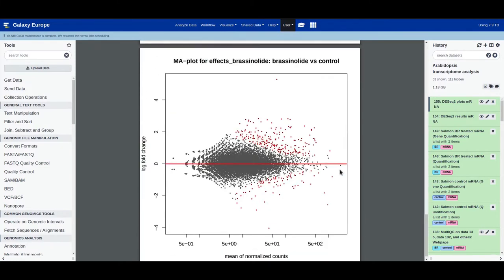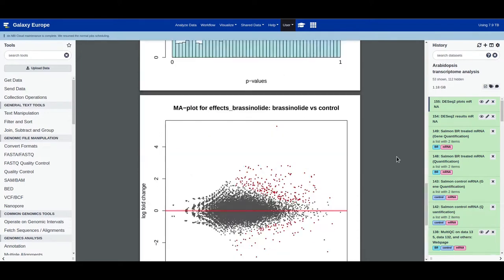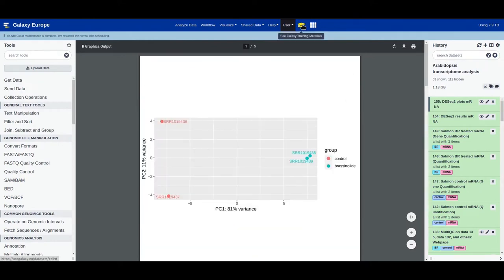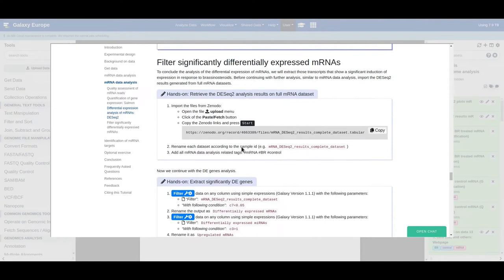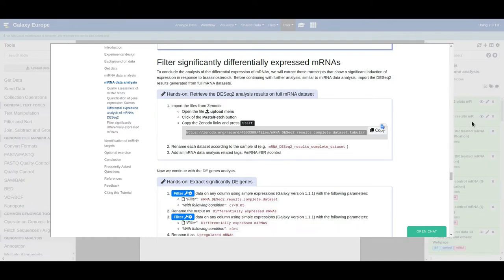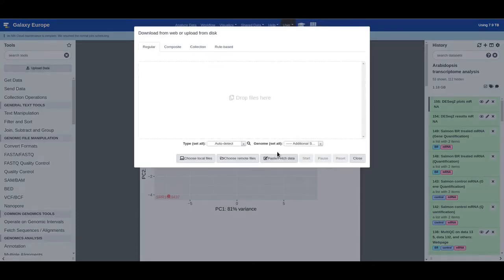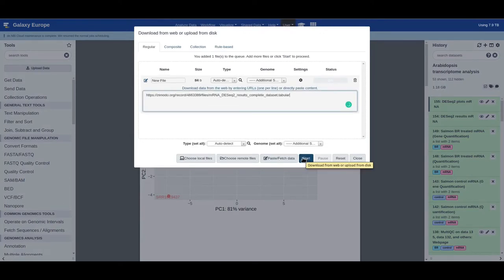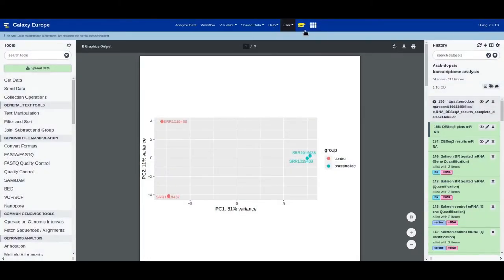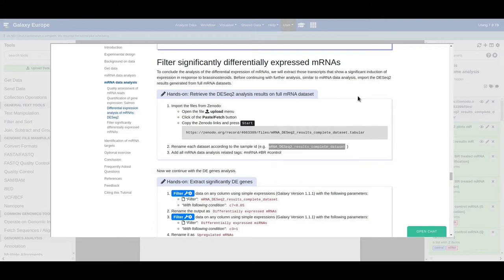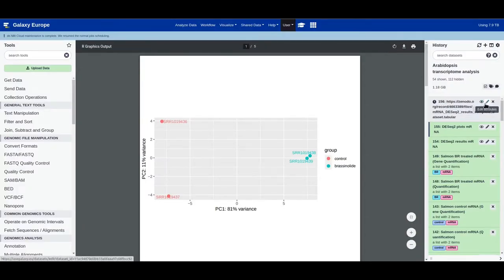Even for this subsample dataset we found some differentially expressed mRNAs. Before continuing further with filtering, we get the results from the complete dataset. Copy the link and upload the data — click on paste/fetch and then click start. Rename this file to 'mRNA DESeq2 results table'.